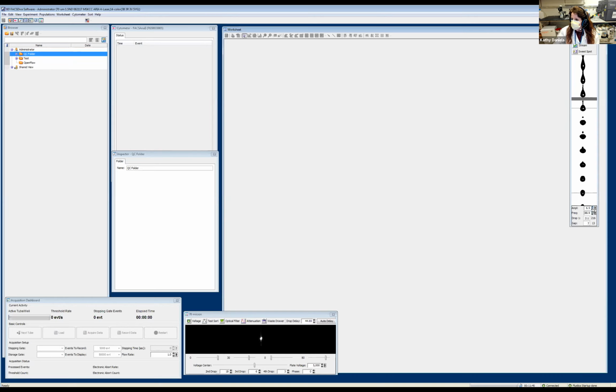So what I'm going to aim for after our initial characterization is to get this gap to match up, and I can do that either manually by adjusting this amplitude, or I can turn this sweet spot on in the software. What's going to happen when I turn the sweet spot on is it's going to automatically modify this amplitude to try and get it as close as possible to these values that we've put in.